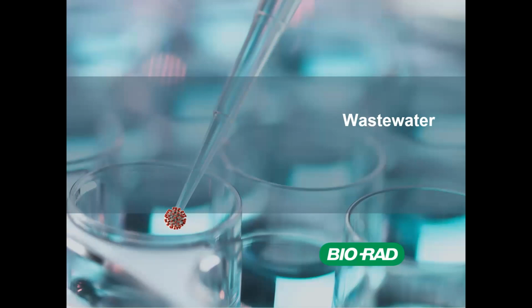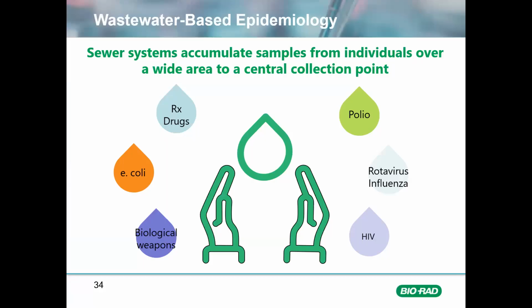Okay, so let's talk about wastewater applications. Wastewater has been a source of investigation for quite a while, and the reason for that is because our sewer systems accumulate samples from various individuals over a wide area, referred to as the sewer shed, and bring all of that sample to a central collection point. So as opposed to trying to measure samples from various individuals, you can get, in essence, a pooled sample. This is often referred to as wastewater-based epidemiology.